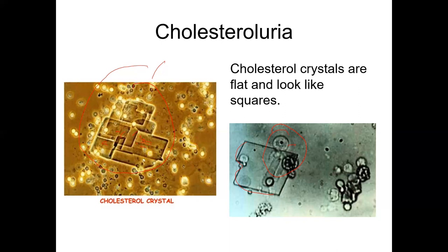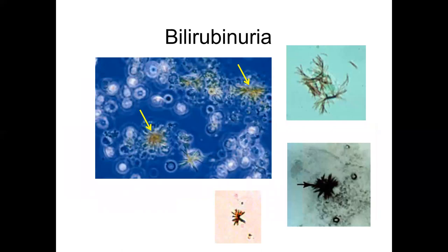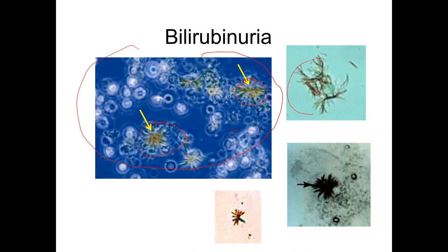This is excess bilirubin in the urine. We do test for bilirubin on the rapid test. This has a one-of-a-kind look — the crystals come in color. This is the bilirubin here; the rest looks like cells, like white blood cells.